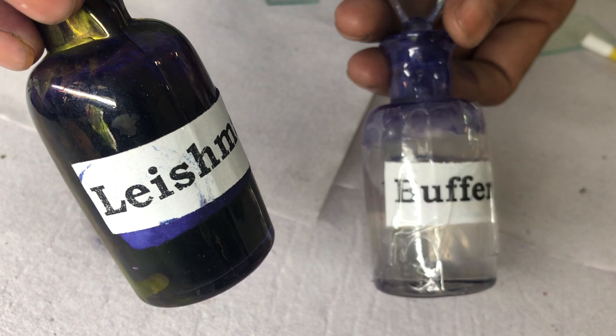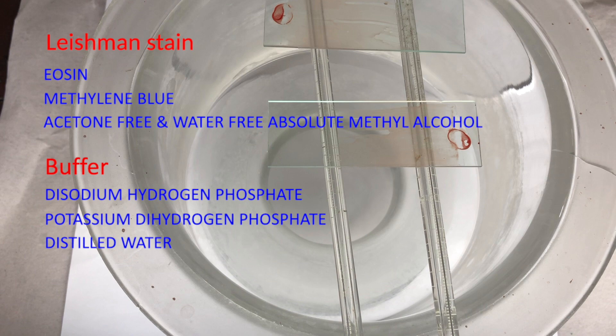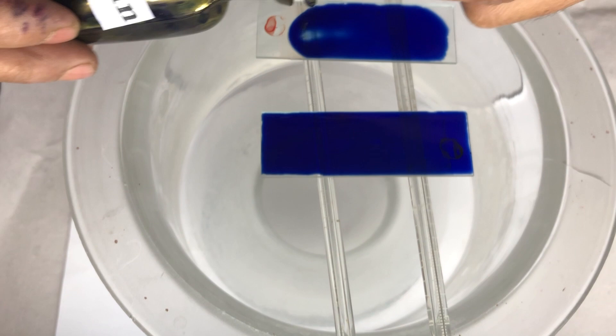For staining the slide, we would be using Leishman stain and buffer solution. For staining, we keep the blood film slide on a washbasin and then we pour Leishman stain onto that film so much so as to cover the film fully.